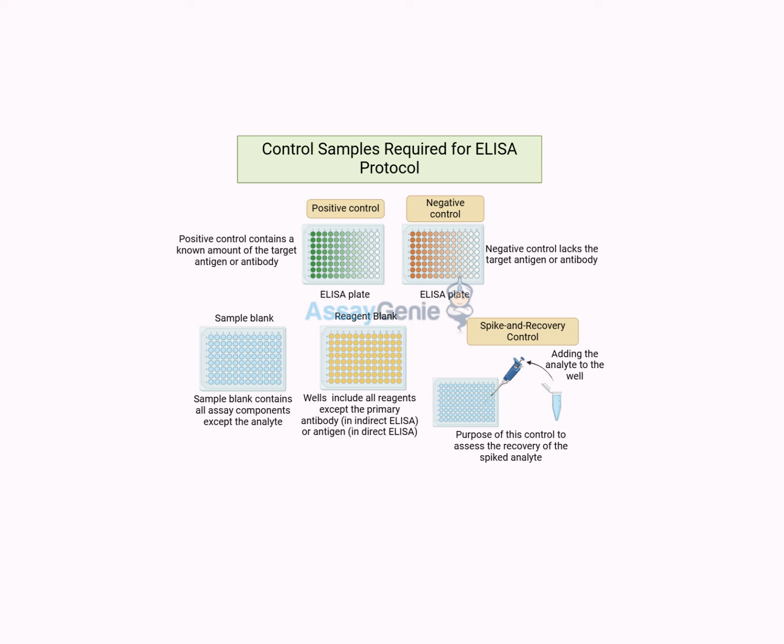What about the other controls in this research context? Well, the positive control would make sure that the ELISA is working correctly and that it can actually detect that protein in the first place. Mm. And the negative control would help to rule out any false positives, for example, if there was some other protein in those cells that was cross-reacting with the ELISA reagents.